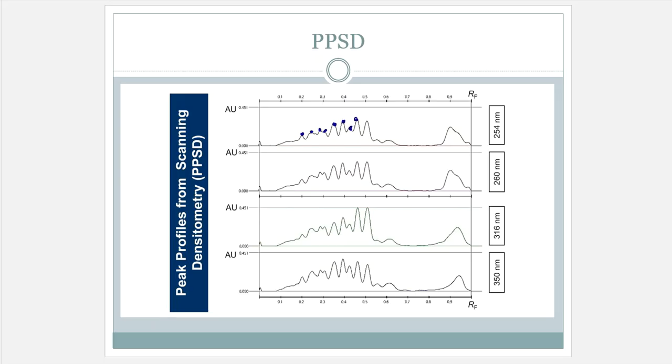So that looks like it is finding multiple components. And these things could be very close together, which is why the baseline doesn't hit in between every single one. There's not enough time for it to do that. So while it's not a traditional chromatogram that has very good resolution, it looks similar to one.